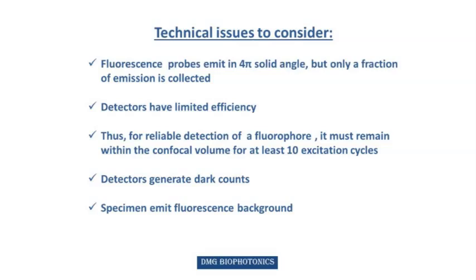Although the principle looks simple, there are technical challenges to consider. Fluorescence probes emit in all directions, but only a fraction of this radiation is collected. Detectors have limited efficiency and generate dark counts. To reliably detect a fluorophore, it must remain within the confocal volume for at least 10 excitation cycles, or 1 microsecond at a 10 MHz laser rate. In addition, the data are affected by background fluorescence.